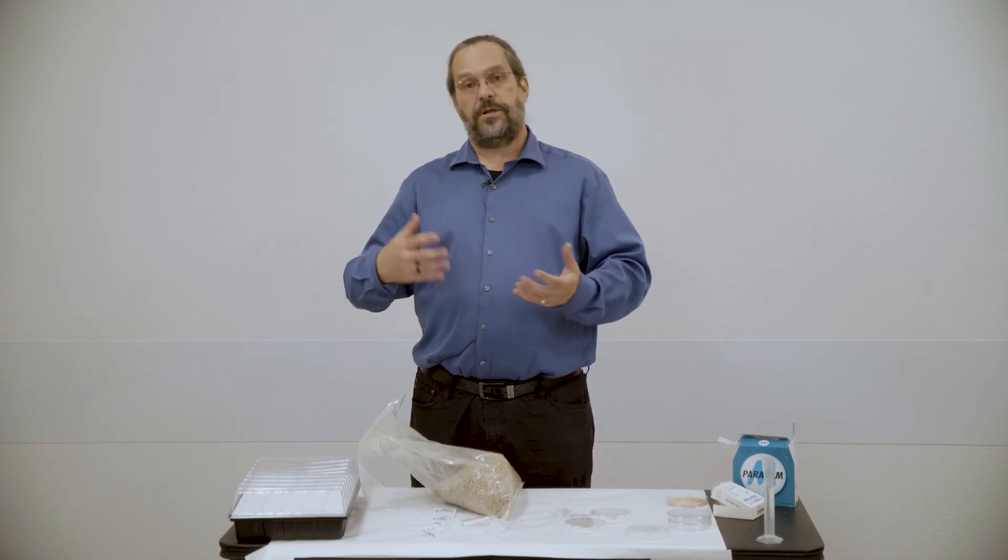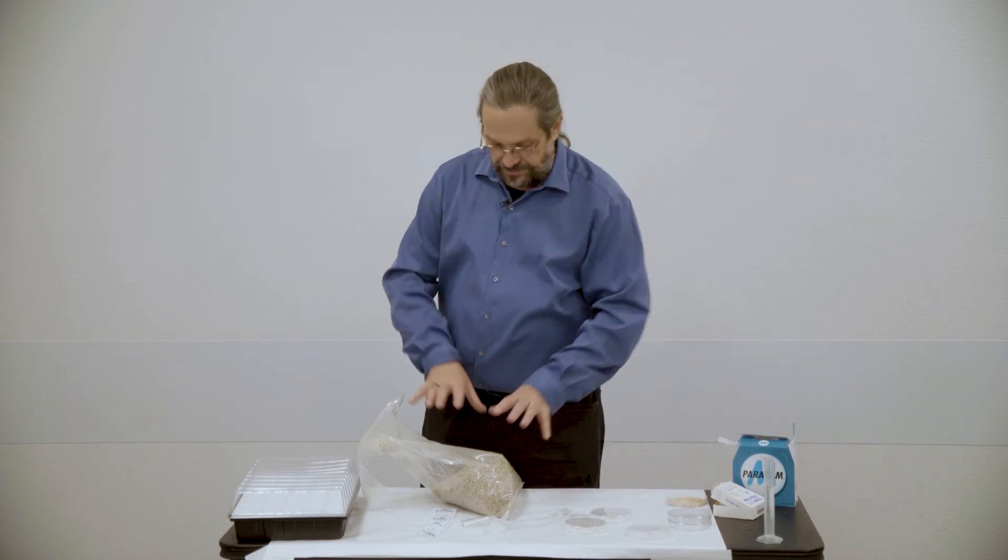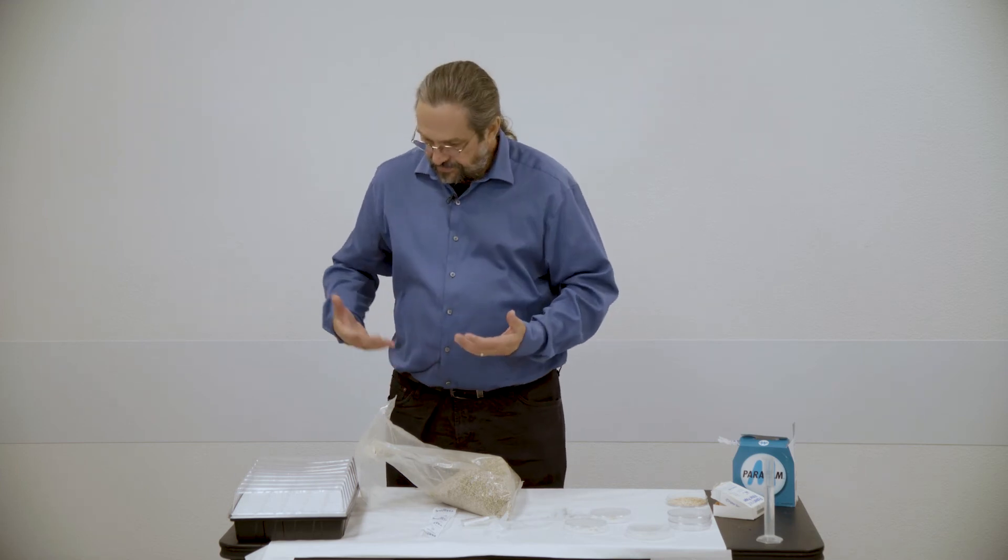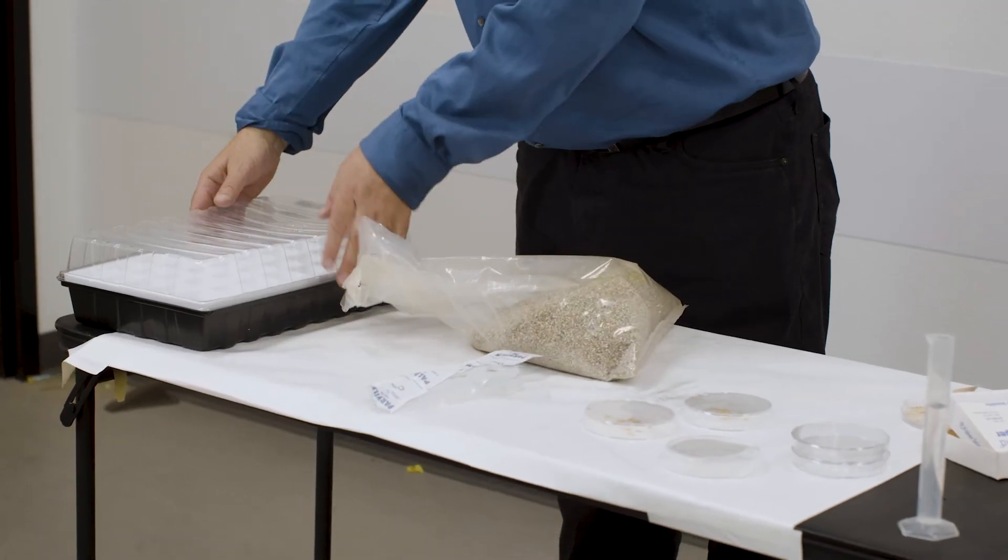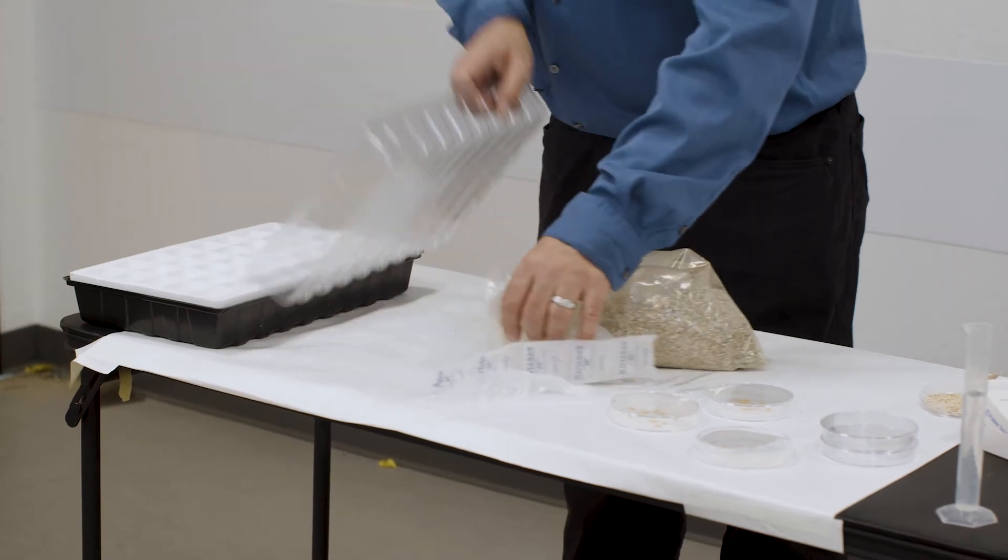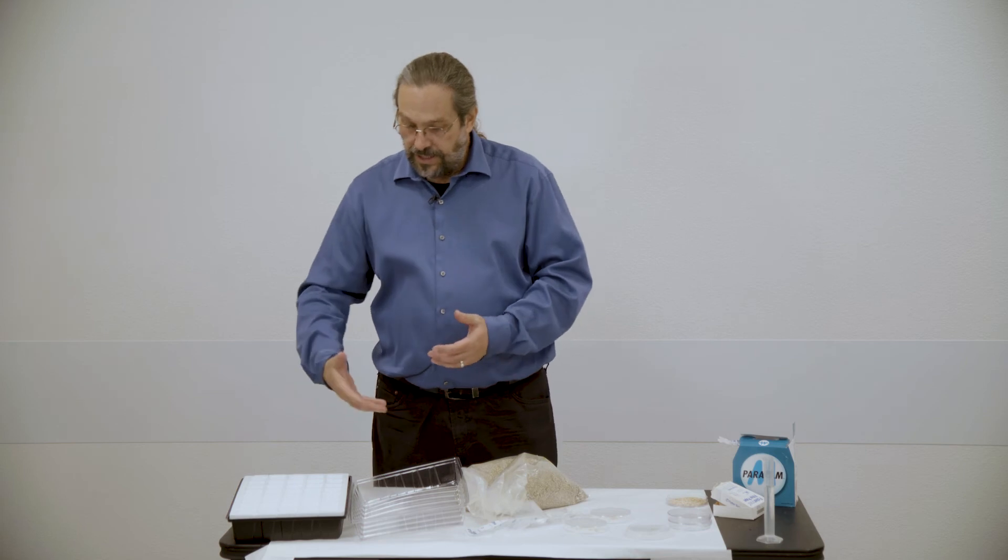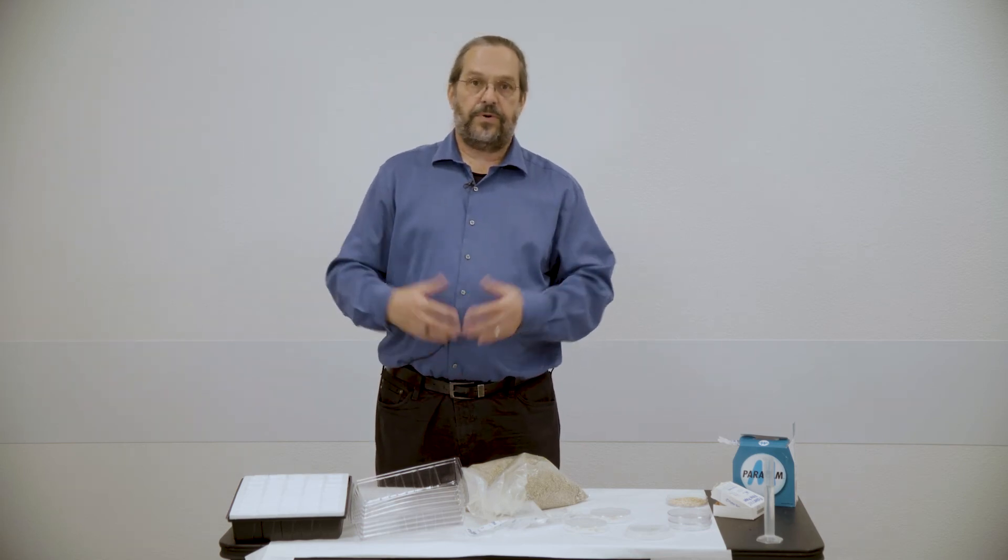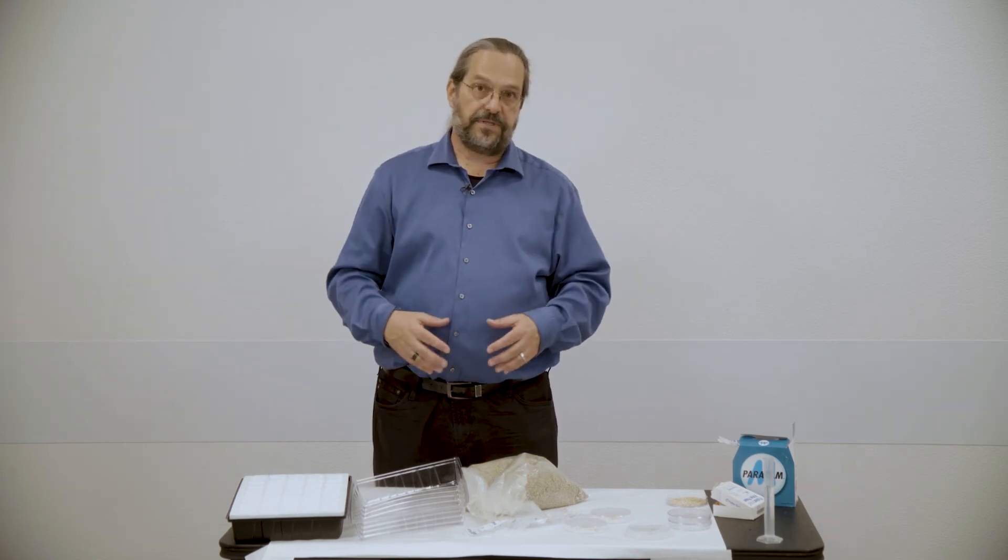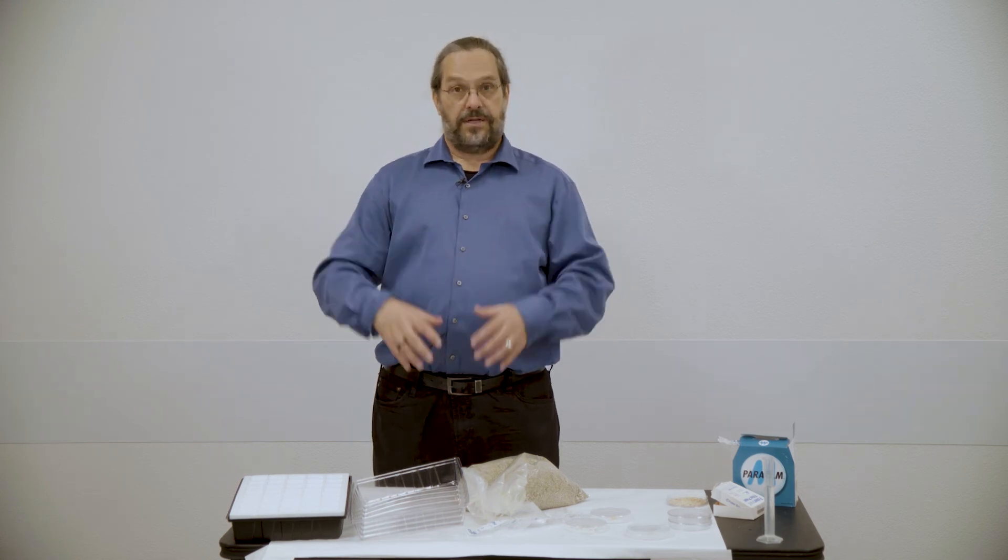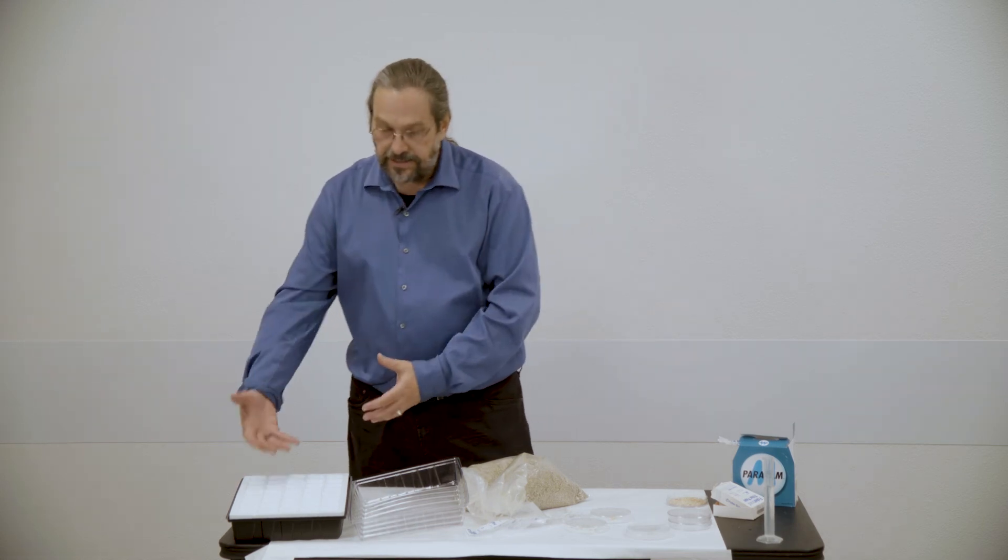So one of the other techniques a number of my student groups have used is to take some sort of potting. So I've got an example of vermiculite here, right? And the nice thing about these seeds is, again, if you use the kinds of planters that usually come with them, that usually come from Wards, you get large numbers of replicates. One of the real important things that I like to emphasize in my research classes is statistical significance and number of replicates.